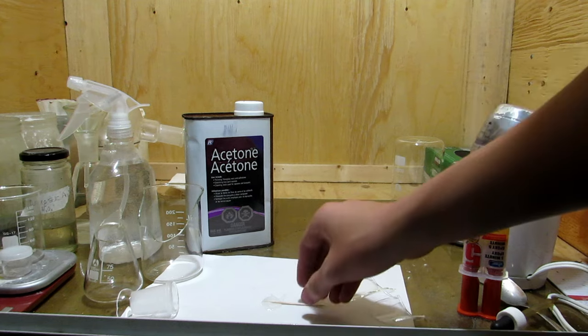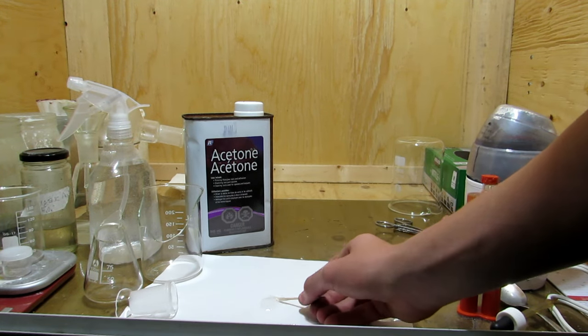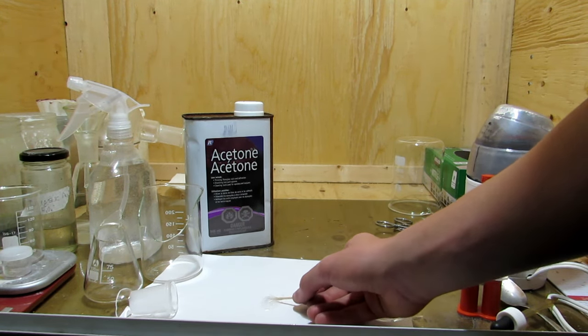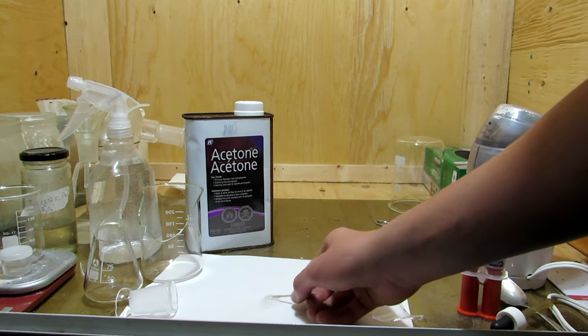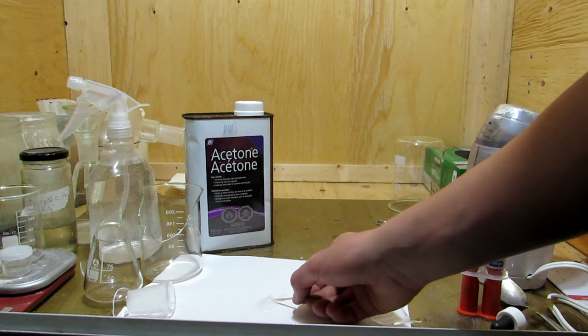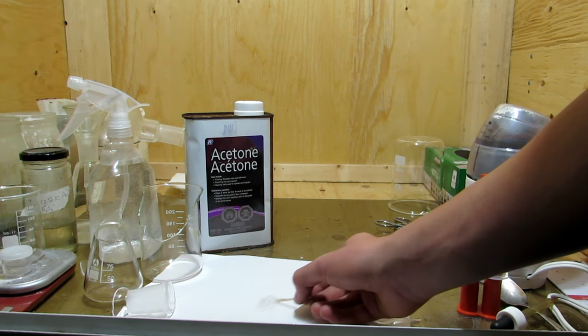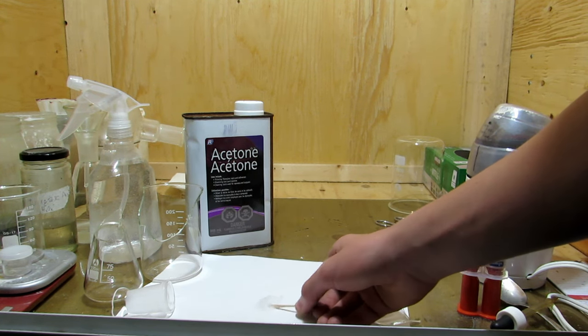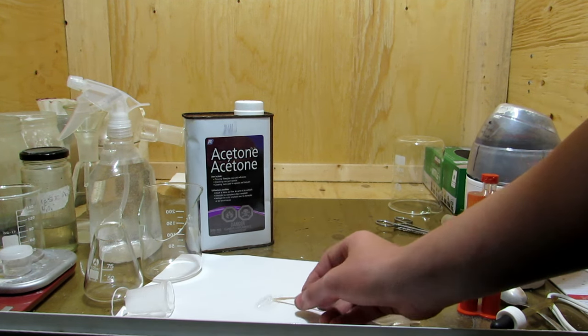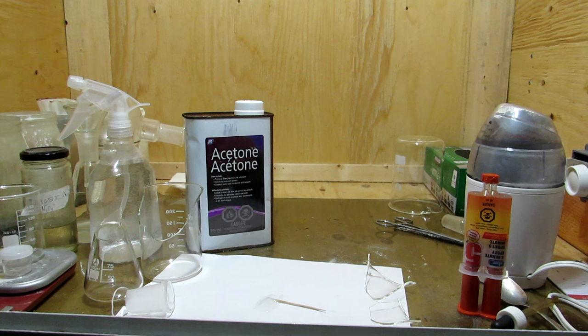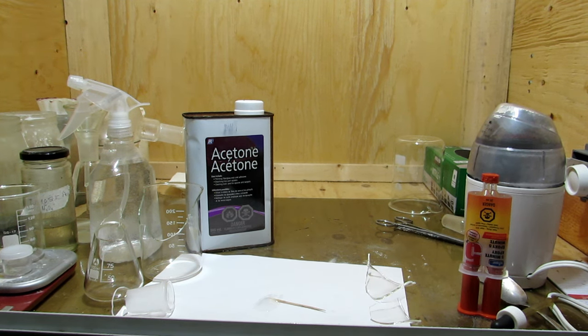Okay, so here in the center I've begun to mix the epoxy. This is five-minute epoxy that you can buy at any dollar store. I bought this at Dollarama. It sets in five minutes. This is actually dependent on how well you mix it. The better you mix it, the quicker it's going to set. So I highly recommend mixing this stuff around for one to two minutes thoroughly to make sure it's really mixed well, so when we apply it to the glass we're not standing there for half an hour while it waits to set. We want it to set as fast as possible.